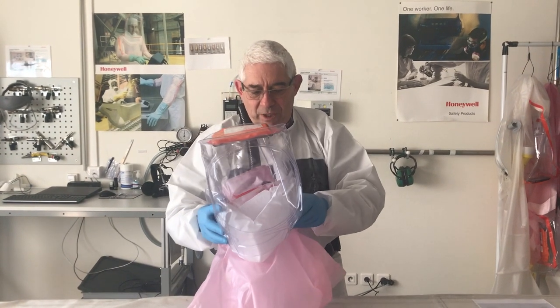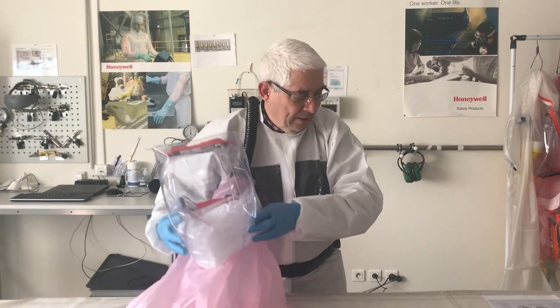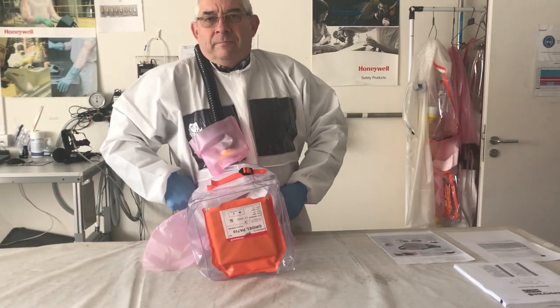This is the same protection factor as the one achieved for the BSL-4 suit in BSL-4 labs. Here you also have the technical documentation.